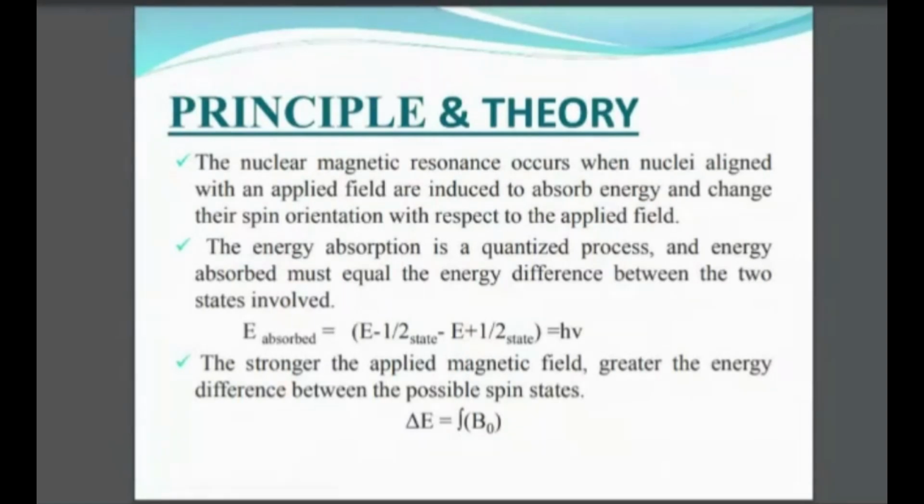So if the value of the magnetic field changes, increases, the applied energy of the electromagnetic radiation should also increase. Do you think my statement is right? What do you think? Is the third point clear to you? Yes, true. Okay, very good. So you people understand it.